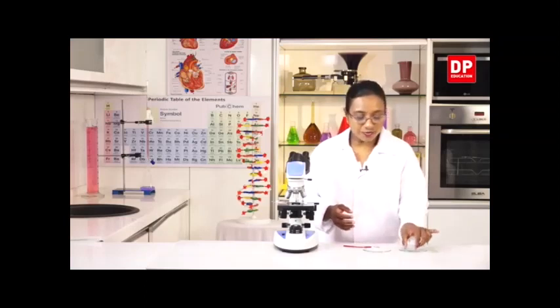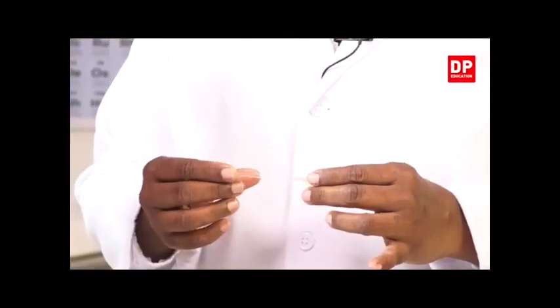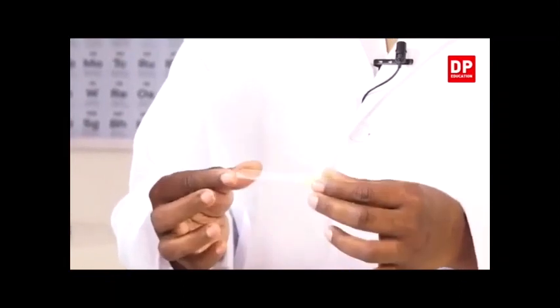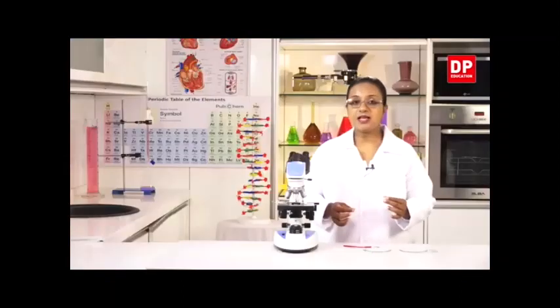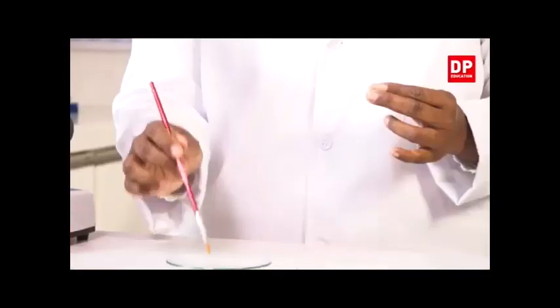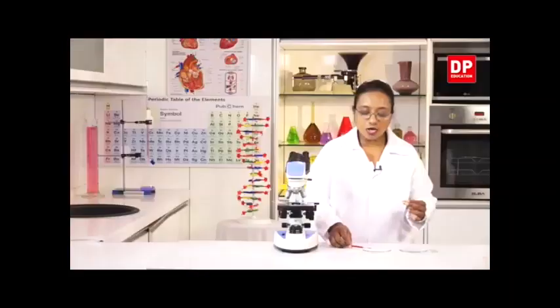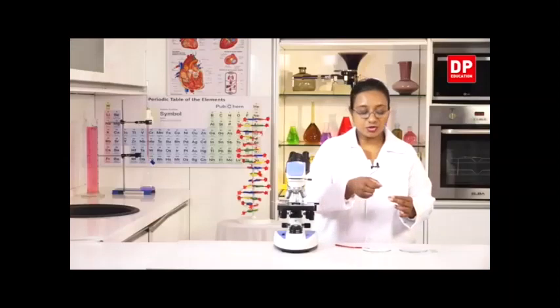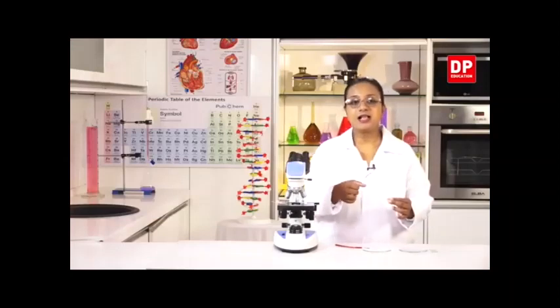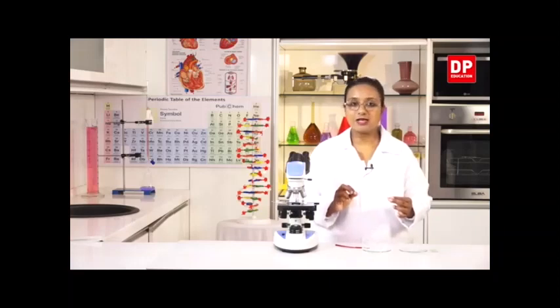As you know, always to prepare a sample or a specimen to observe under the light microscope, we have to use a glass slide. This is something that's familiar to you, and on this glass slide, we need to put a drop of water using a brush like this. We will put a drop of water, and onto that, we will have to spread the cheek cell as a smear. Just spread it on the glass slide.